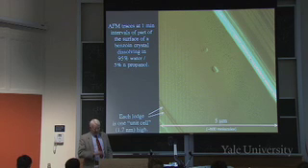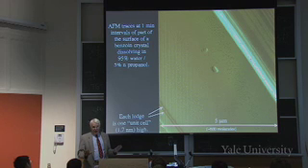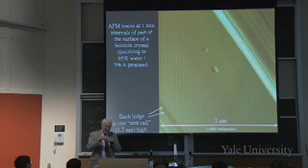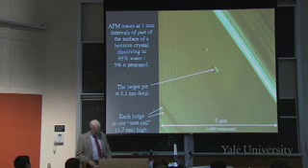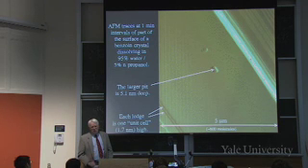So these are, and the top surface where it's flat is absolutely flat, right? Except for there's little holes there. And those holes were made by taking this tip and pressing down and scratching a little bit to knock some of the molecules away. So that the larger pit is 5 nanometers deep, which means it's 4 layers of molecules been knocked off in there. And now this is underwater, or underwater in propanol, so the crystal is dissolving slowly. So those pits open up as molecules come away.